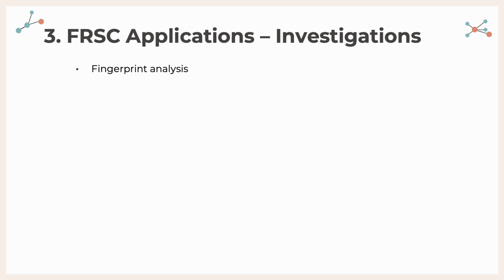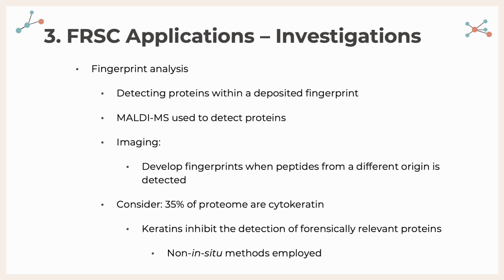Now, fingerprint analysis is the first part of the investigations topic. So with fingerprint analysis, you are detecting proteins within a deposited fingerprint to get the spatial yield of the proteins. And you are typically using MALDI-MS for this. So recall MALDI, matrix-assisted laser desorption ionization, is an ambient technique, making it more accessible for in situ proteomics.